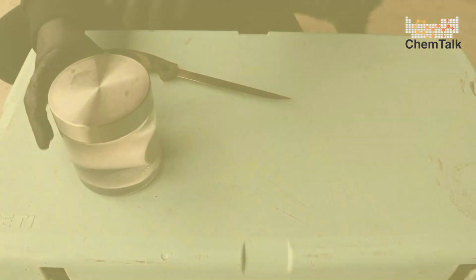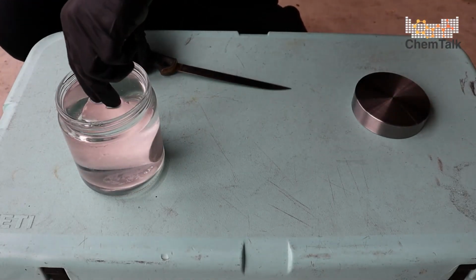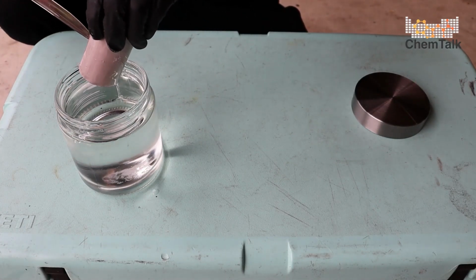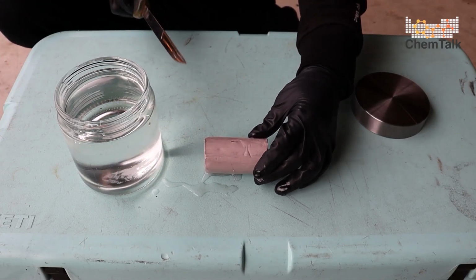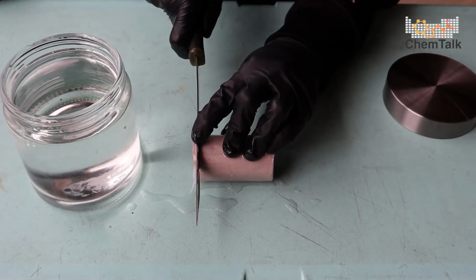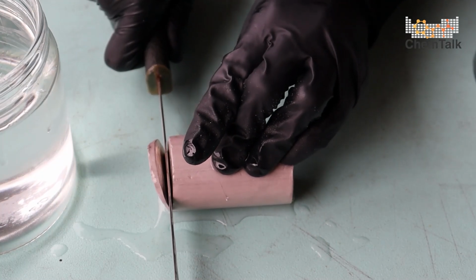Sodium compounds such as sodium chloride or table salt are very common in our society and are relatively stable. However, sodium metal in its pure form reacts very, very violently with water. Sodium also has a tendency to react with the water in your body and can cause some very bad chemical burns. Remember how we told you earlier that we store sodium in oil? This is why. Sodium is very dangerous, so don't do this experiment at home.